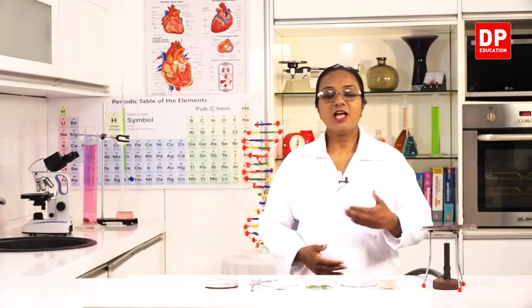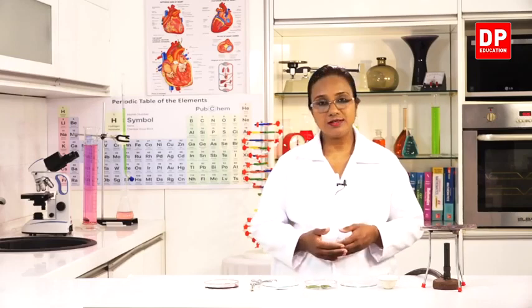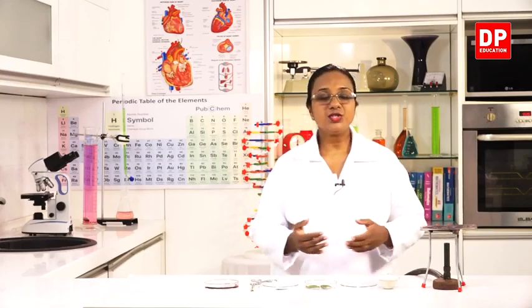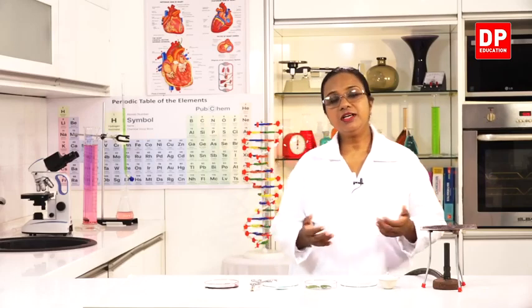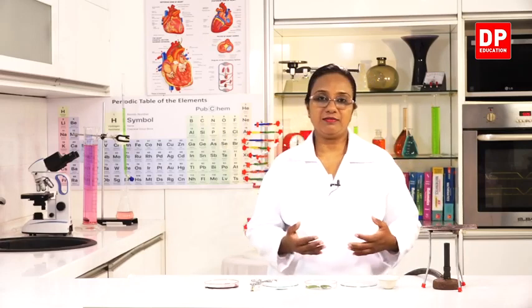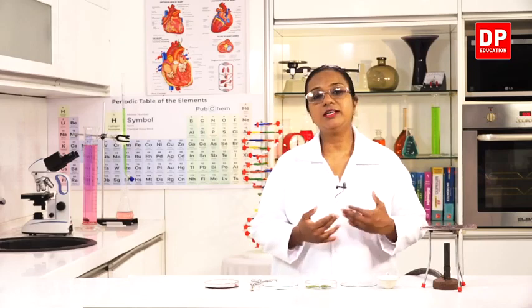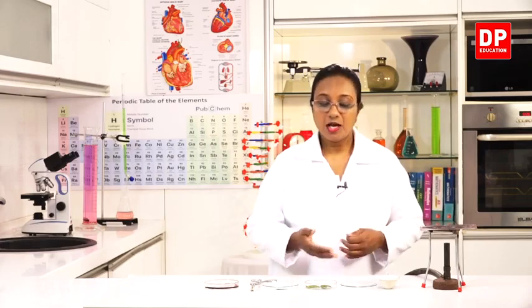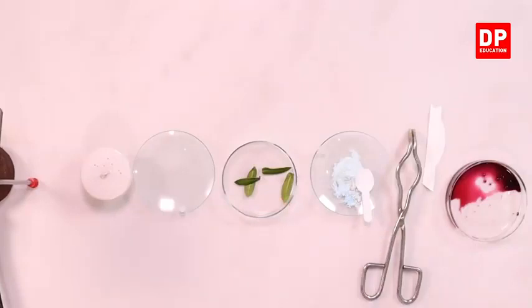Okay students, now we are going to do an activity to test the presence of water in food samples. For this, you can use any type of leafy vegetable or fish, meat, or even any type of leaf, because all living organisms contain water in their body. Today, I am going to use some leaves from a garden plant.